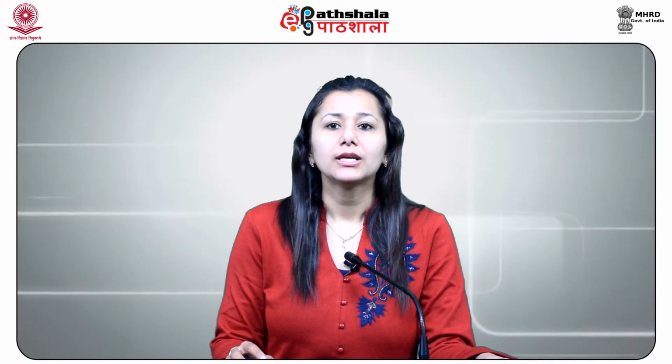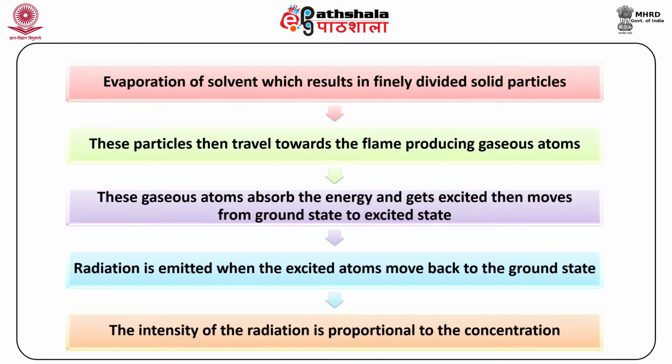Now we shall see the working of flame photometry. First step is nebulization. In this step, the solution that is to be analyzed is aspirated into the burner system, which converts the solution into small fine particles. The nebulization process is shown in the following steps. Evaporation of solvent, which results in finely divided solid particles.